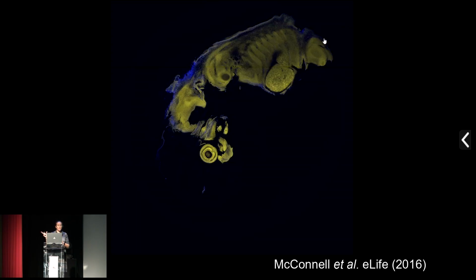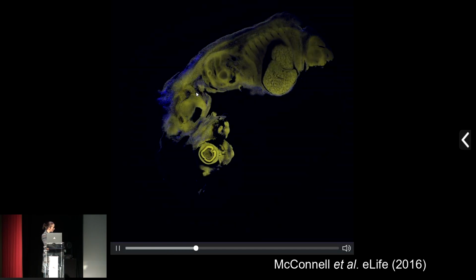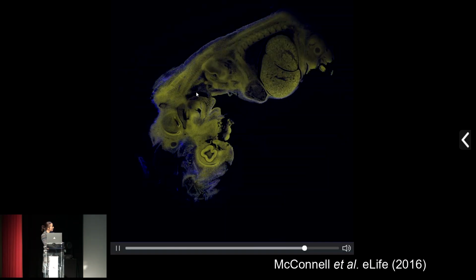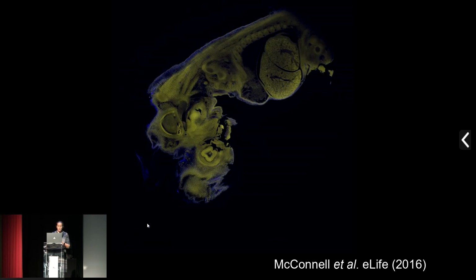The field of view here is 6 millimeters. We're only going to optically section through about 200 micron, but we can do the whole mouse embryo. Just takes us a little while. And hopefully, if I press play in this movie, you'll be able to see, for example, features such as the ribs disappear, the liver come into view, and the edge of the brain eventually we start to see. And that's only over about 200 micron thick or so. So we do have exquisite optical sectioning.